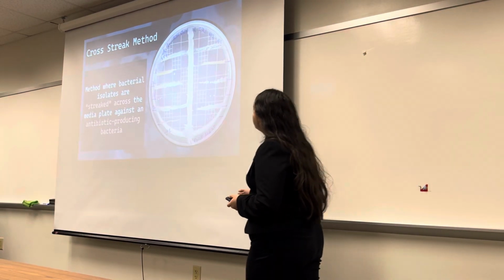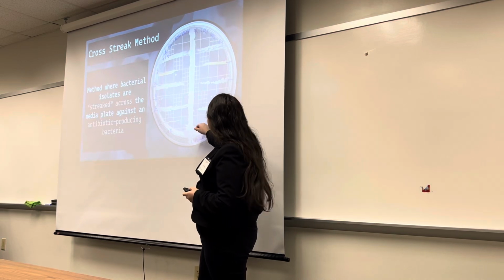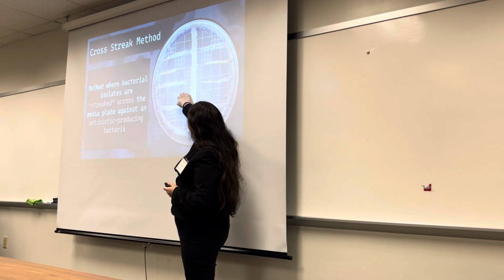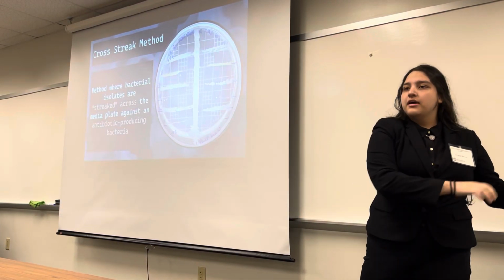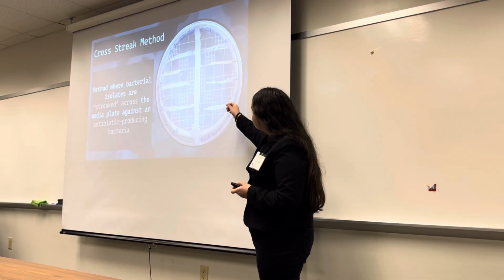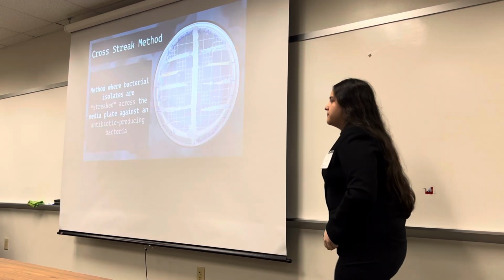You can see that while some of these do touch, that is not an interaction between the bacterial colony and the antibiotic production. However, for isolate number 3, you can see that it's still being pushed away by the antibiotic-producing bacteria. And you can see the same for my positive control as well.